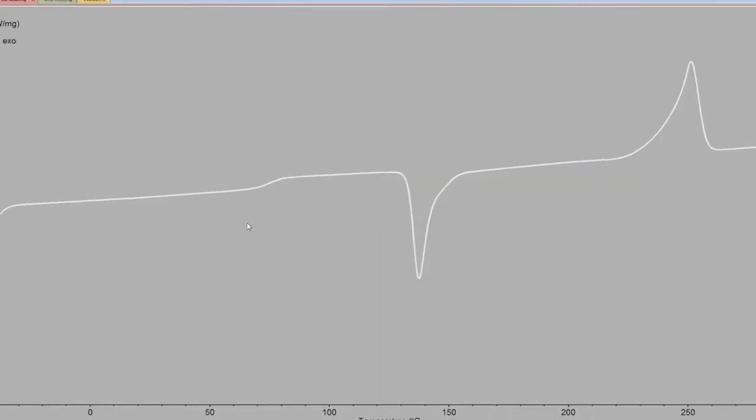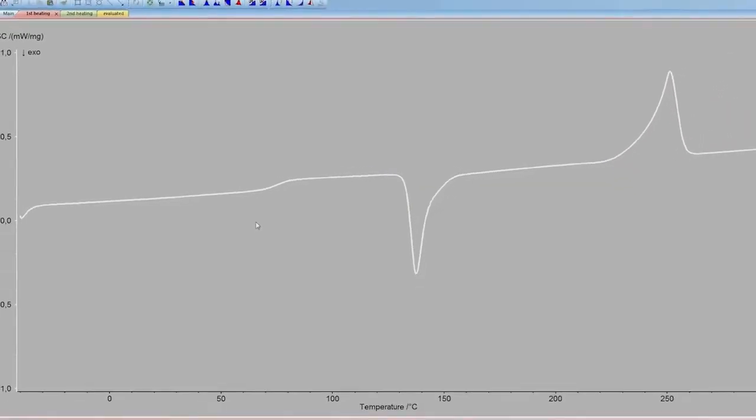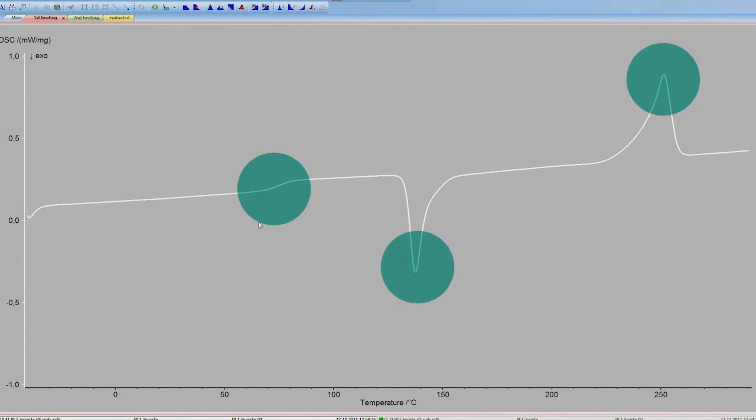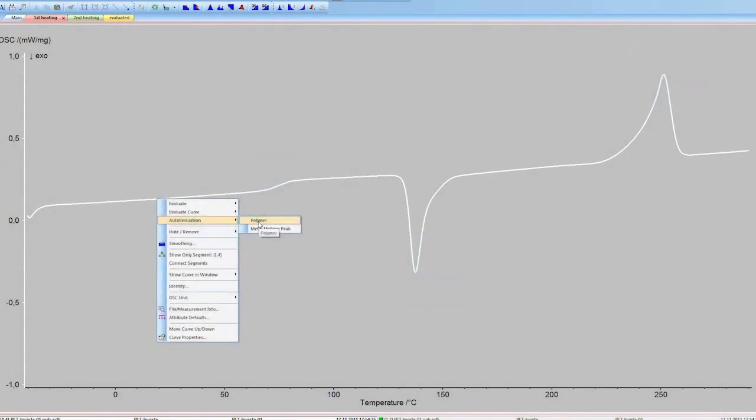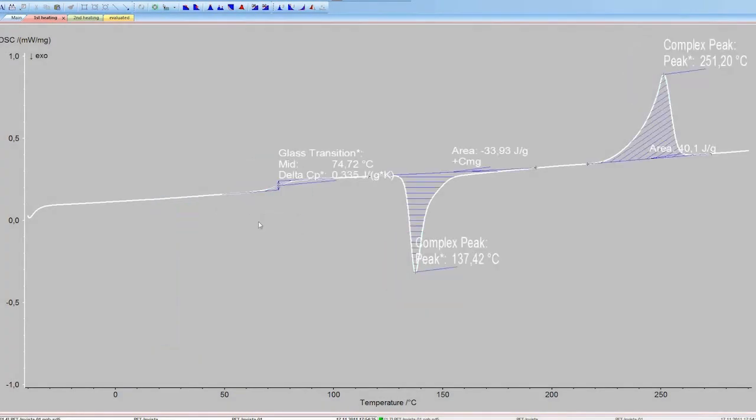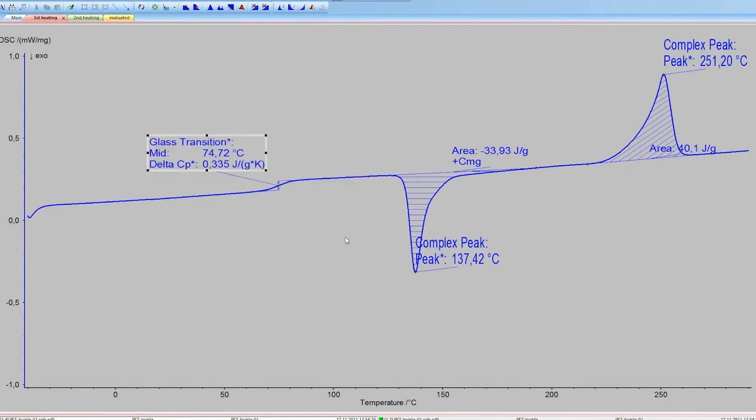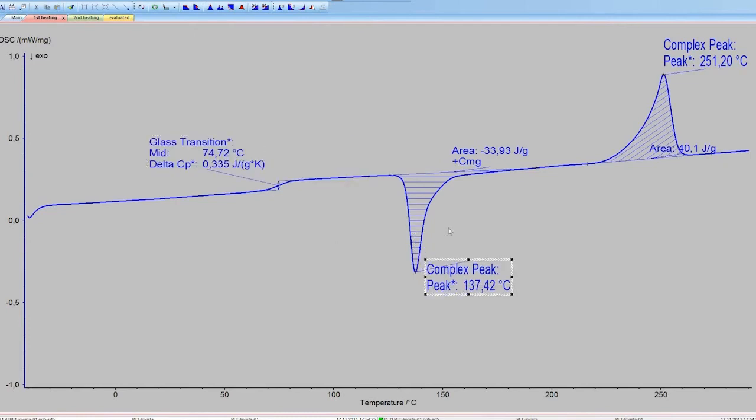Imagine a highly developed software that is able to recognize the thermal effects of the measured curve and to automatically evaluate them, all that with one single mouse click. This saves time and lets beginners and experts come quickly to objective results.